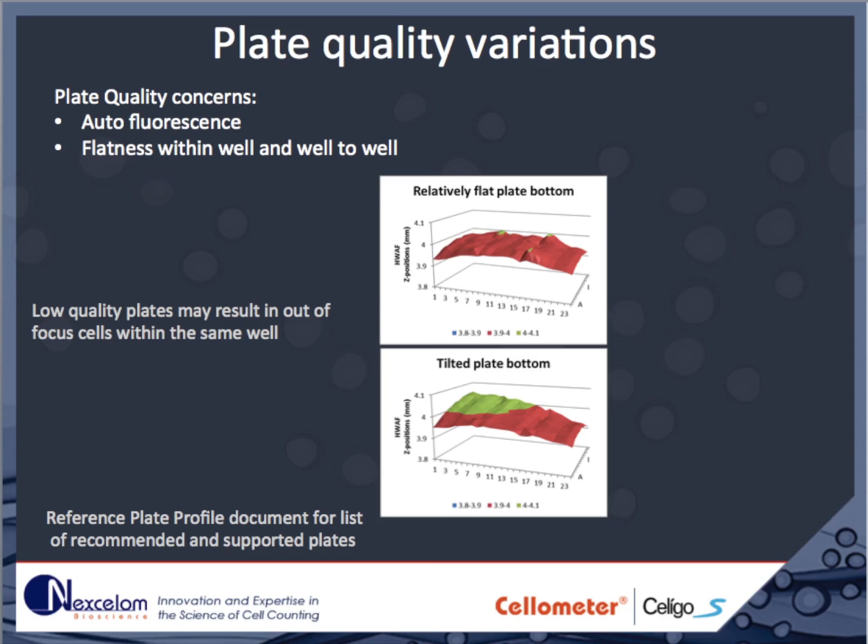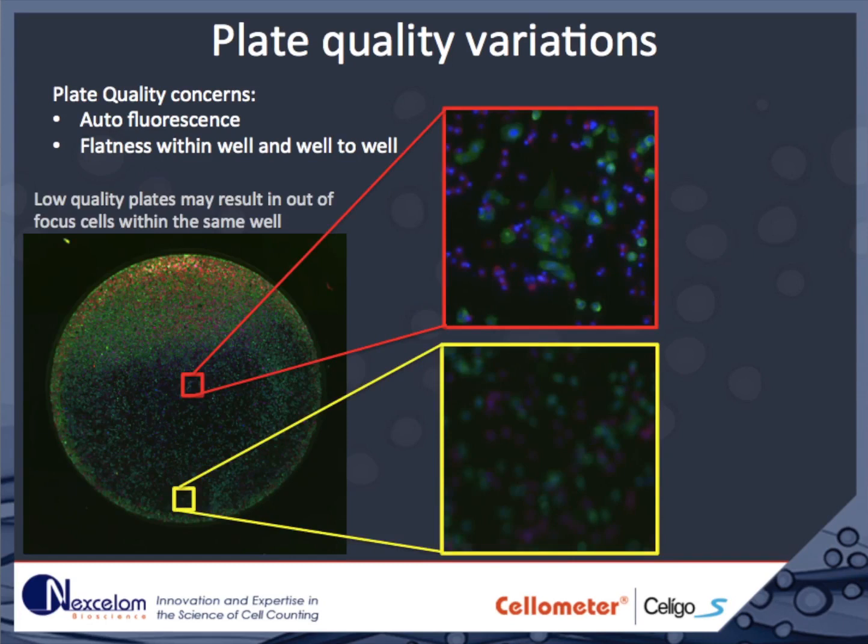Another important consideration is the flatness of the plate, both from well to well and within a well. Low-quality plates may result in out-of-focus cells within the same well. While these problems are more prominent in large-format dishes such as six-well plates, they do occur in some varieties of 96-well plates. You can see cells in the center of the well are in focus, but out at the edge they are out-of-focus, making it difficult to discern one cell from another.